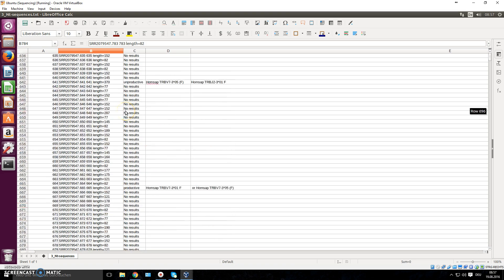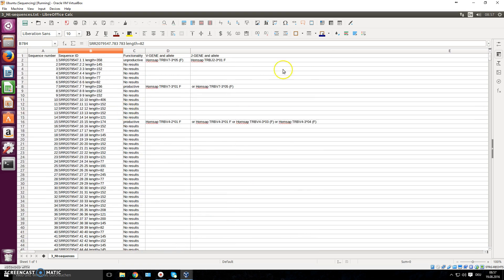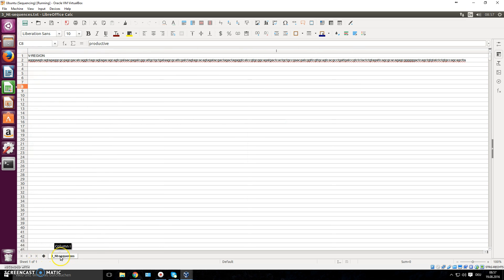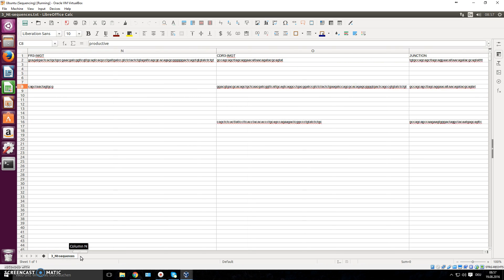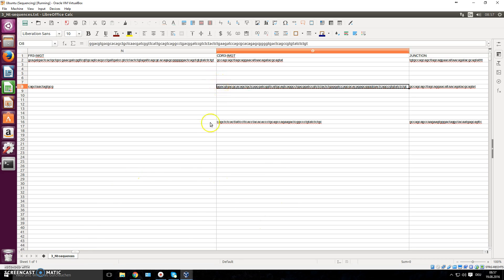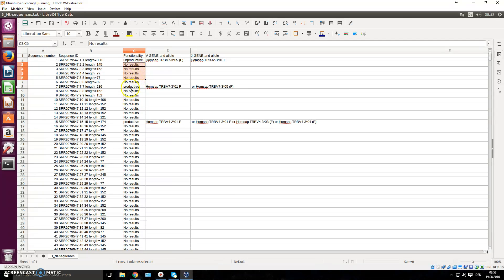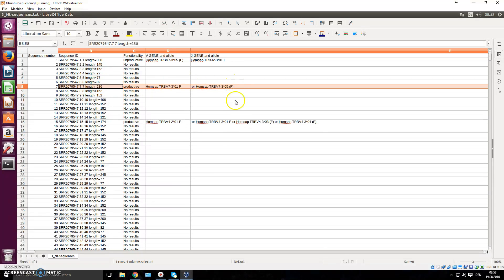Open that file up and you can see what kind of information is in here. You have a sequence number ID, you have the functionality — unproductive, no results, or productive — and go ahead and look at all the different columns. You have the V region that's been annotated, and here you'll have the CDR3 region, which is a very important region. The next step is further analyzing this — for example, removing all 'no results' and extracting all the productive lines into a separate folder, which we'll do in a separate video. That's how you align your TCR data with IMGT.